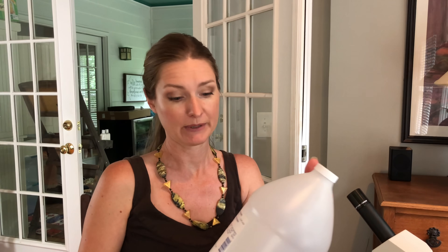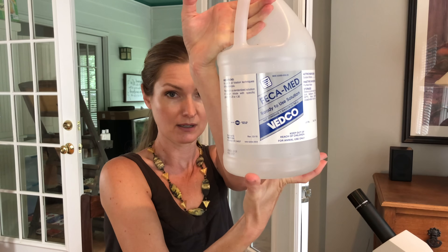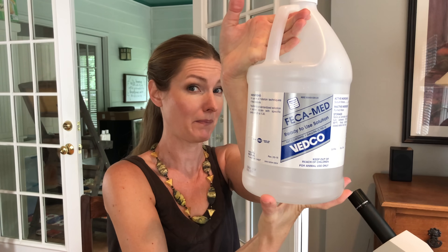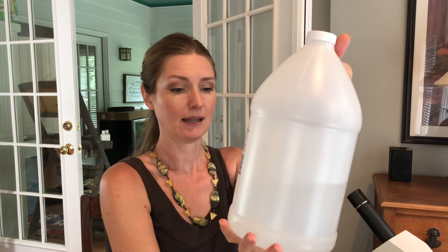The next thing you're going to need is a flotation solution. There are directions online for how to make your own from Epsom salts — you just need a really concentrated solution — but it's just extra work. So I went on Amazon and bought this one. I think this gallon was about $30 delivered, and I've had it for a couple of years now. I've only used about half of it, so it lasts an awfully long time. I would just invest in this.